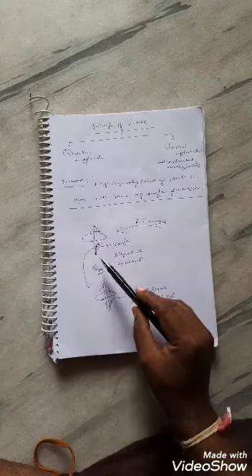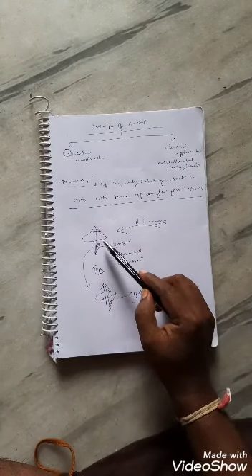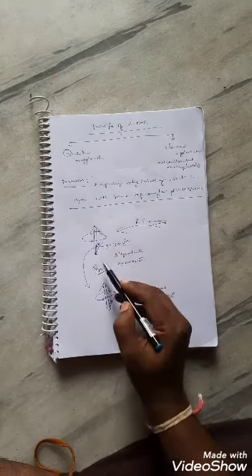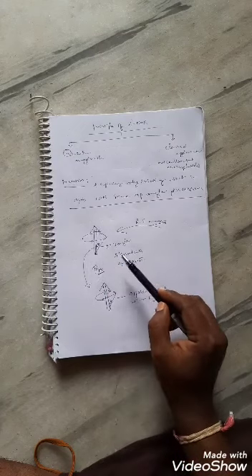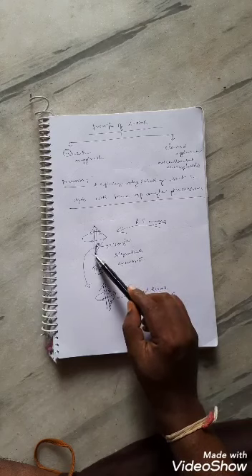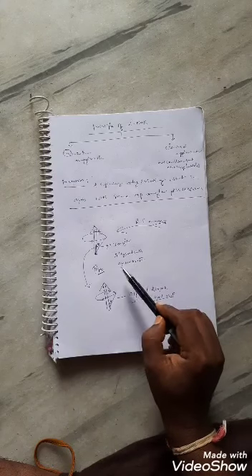So when you apply an external magnetic field, this nuclear magnet goes on precessing with some tip angle theta, and the direction of this precession is aligned with the external magnetic field.